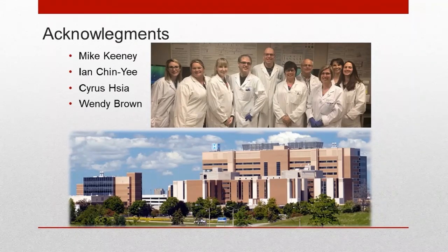If you have your own AML MRD panel, there are lots of them published everywhere. It's possible, yes. Whether you could do it with just a single tube is debatable. Lots of people do it now. Obviously, the M1 and the M2 tubes do give you a complete picture of what is happening with the myeloid tube, so yes, you could do it with both.